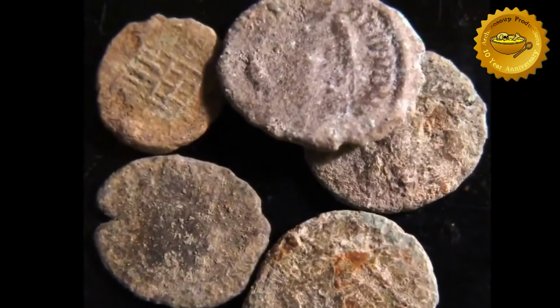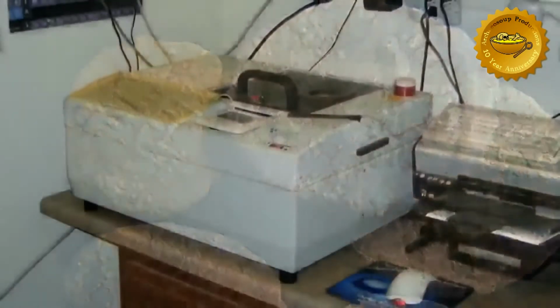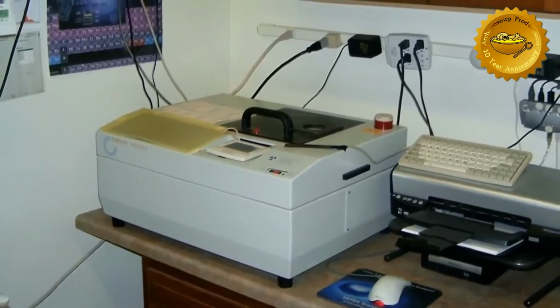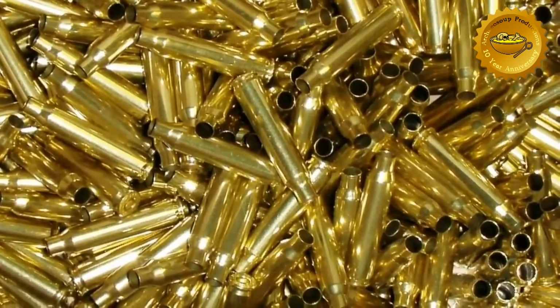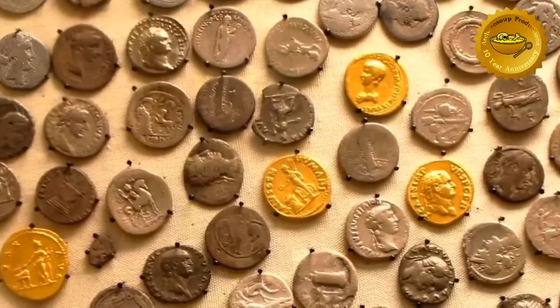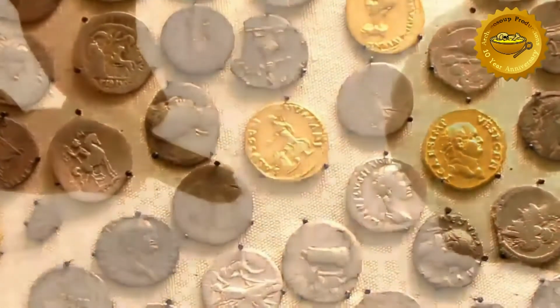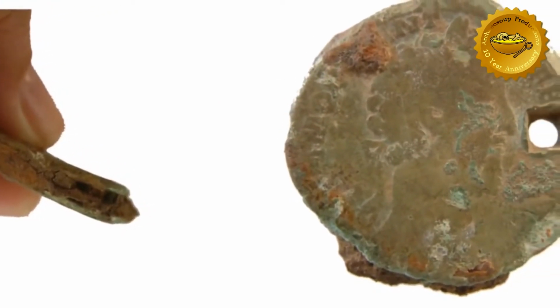Imagine you have excavated coins which cannot be identified by eye due to corrosion. You pass them through an EDXF machine and it reveals that part of its constituents are copper and zinc, also known as brass. Believe it or not, brass is not a common metal in the world of ancient coins, and only one group are known to have used it widely. These are the Romans, so chances are that you're holding Roman coins.